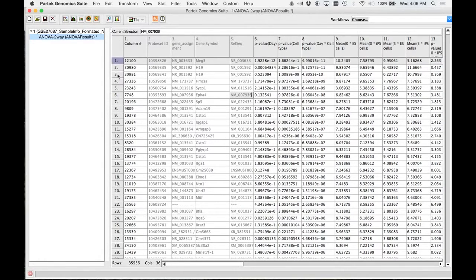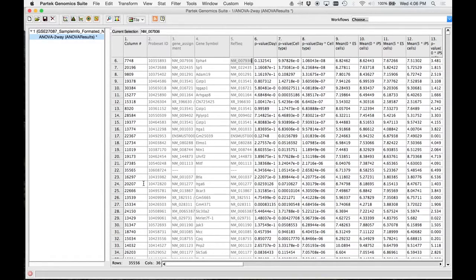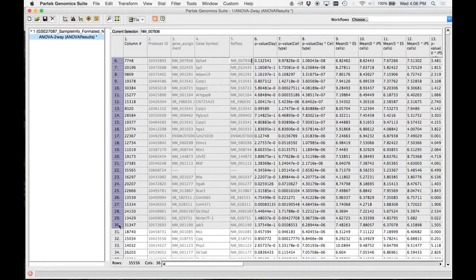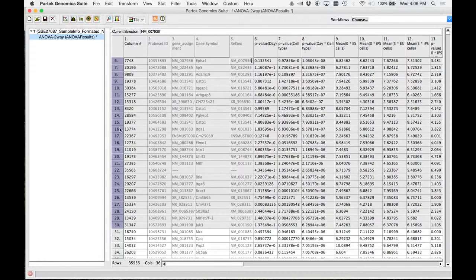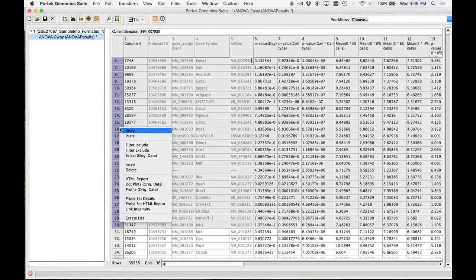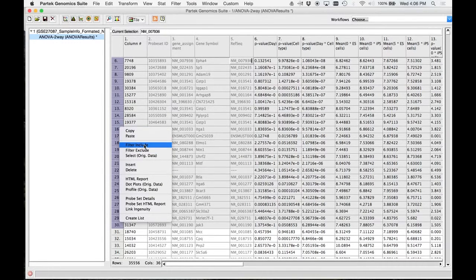So put your cursor on number one, go down to 30, hit shift, and then you'll select all those. Now, right-click and go filter include.